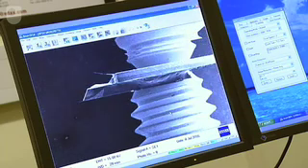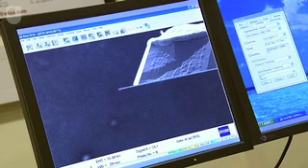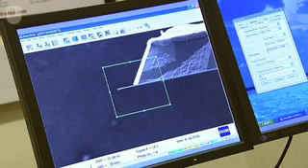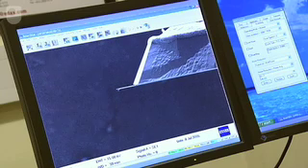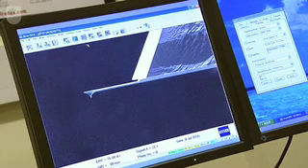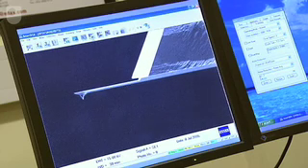As we increase the magnification we can begin to make out the cantilever arm in which we're most interested. We can bring that to the centre of the screen and increase the magnification further. Then we can fine focus the image before we slow the scanning rate down to see the image as we want to.